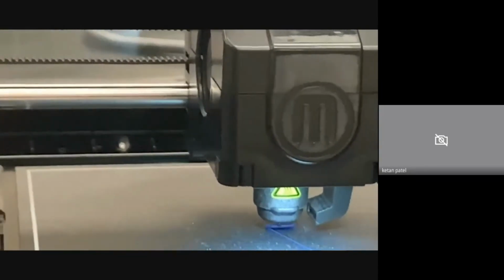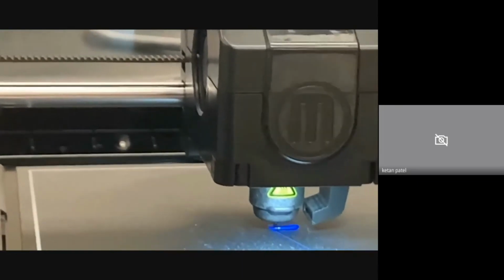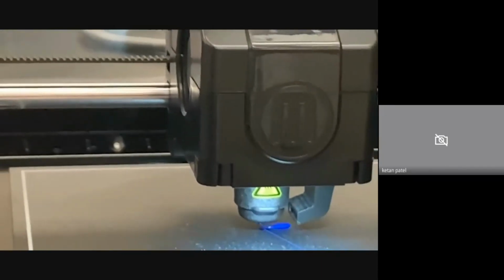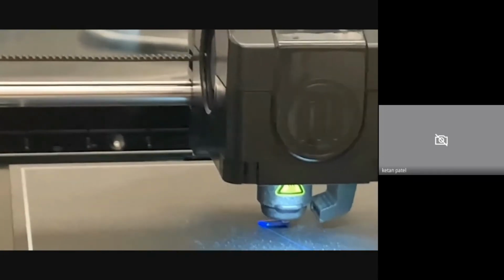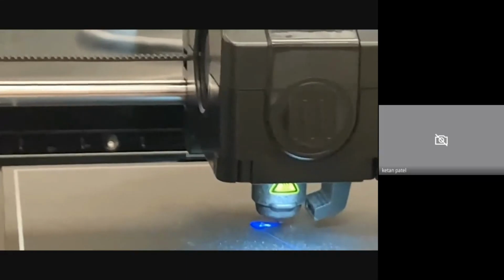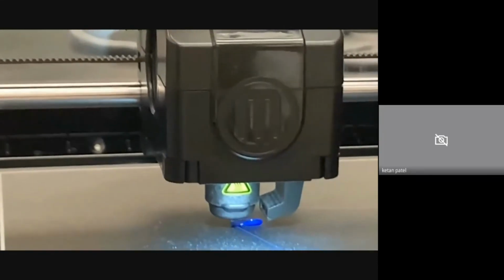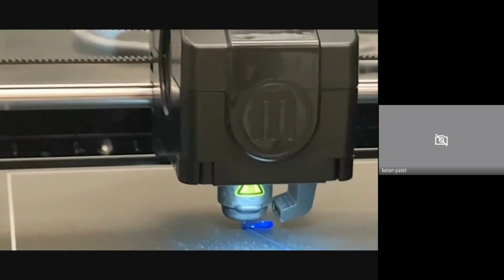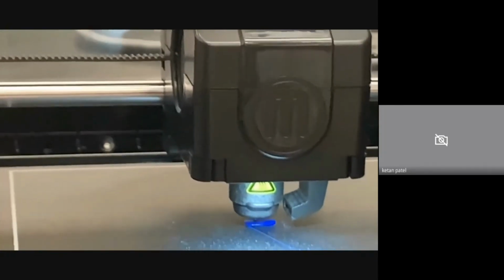And as you see, the layer height and the layer thickness are very uniform when it comes to FDM 3D printing. On average, a tablet or a caplet with a length of around 10 to 12 mm would print in approximately 1 minute to 1 minute 30 seconds. And the end product is basically a deliverable, like an orally deliverable tablet.